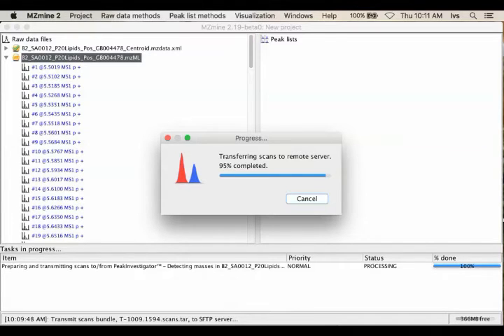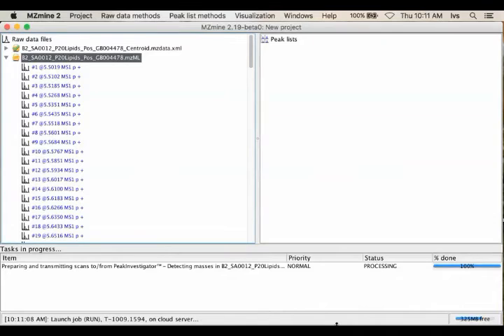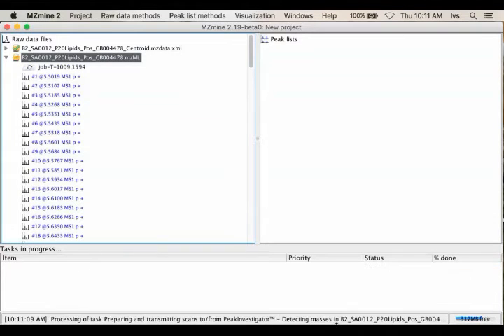Now you should note, when the transmission ends successfully, a unique job number in the cloud icon here is placed into the data directory. This is a unique feature in the MZmine PI edition. We use this unique job identifier to anonymize your data on the Veritomics servers. If you lose this information, your results cannot be retrieved. You will click this cloud icon to retrieve your spectral mass list back into this MZmine project.